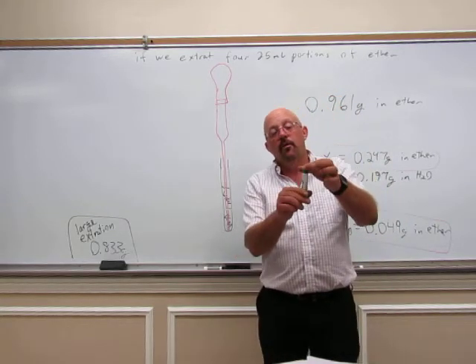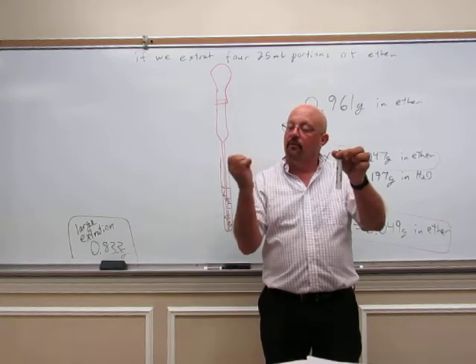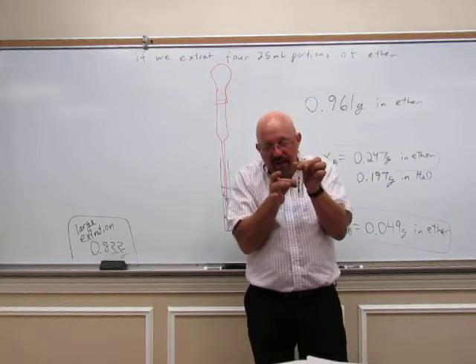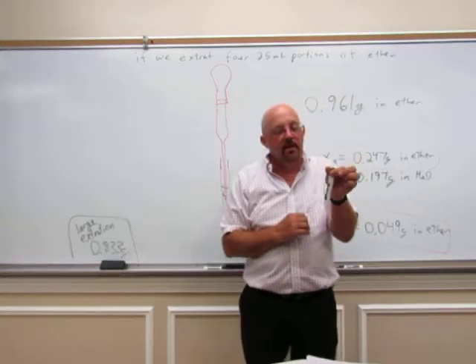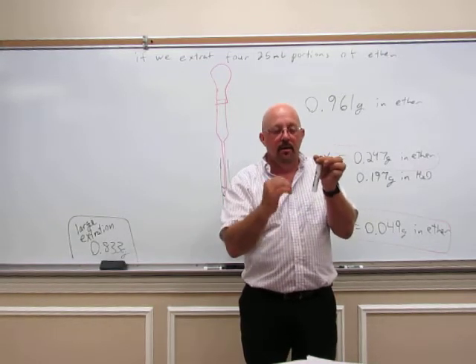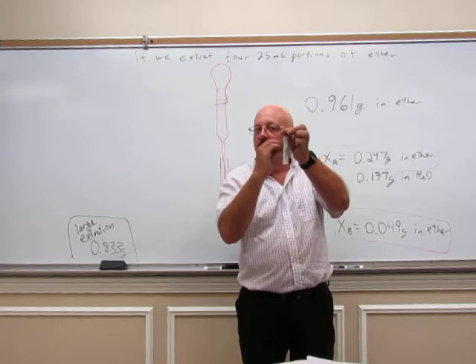You want to hold it at the top and hold it good and tight. And you want to take your fingernails and just flick off to the side. Don't sit there and flick like this. This does nothing. That will do absolutely nothing. You want to just glance off to the side. And if you do that and just keep flicking, you can go really, really fast.